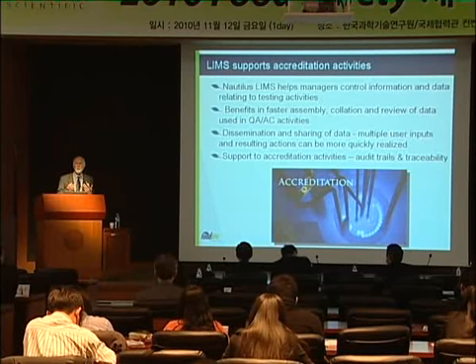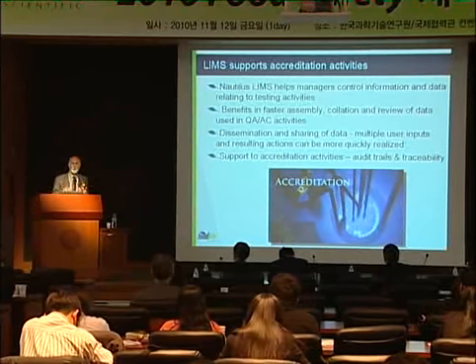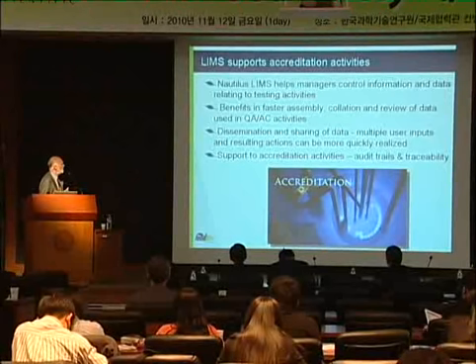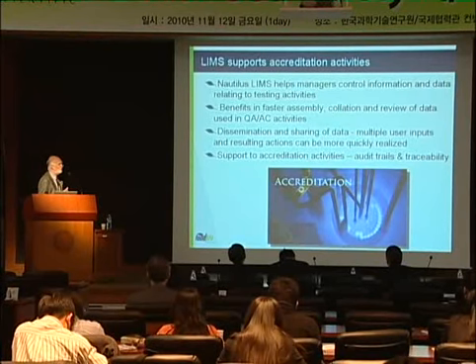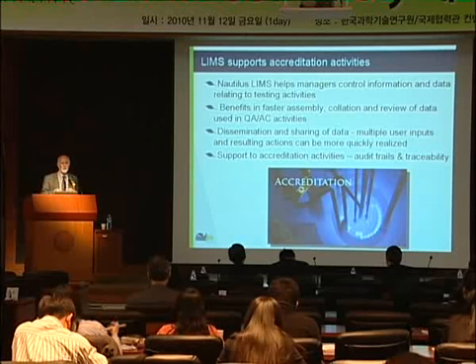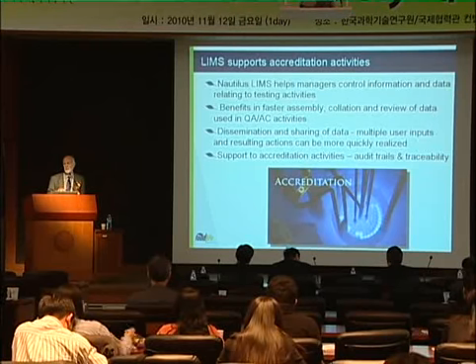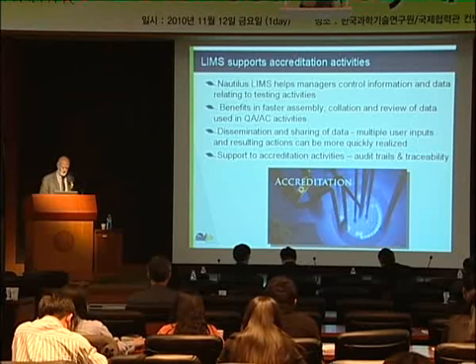And you can imagine in a laboratory that doesn't have a LIMS system, somebody has to go and try to find where the laboratory books were stored, where the hard copy data was stored. So the LIMS system provides very rapid ability to assemble and collate raw data and show it to the assessors. It can also mean that in a big laboratory, many labs now employing several hundred staff, data can be shared by staff within the laboratory by online access in the offices. So a very important resource to support accreditation as well.